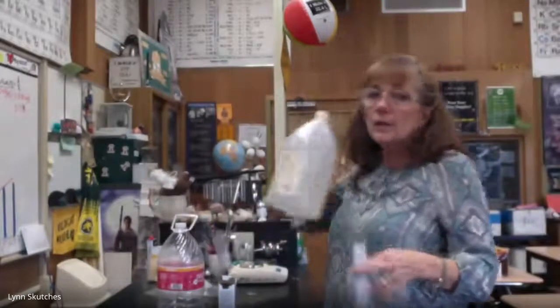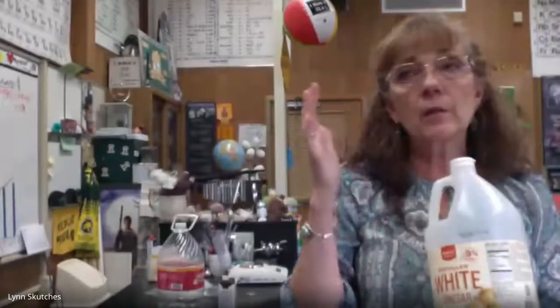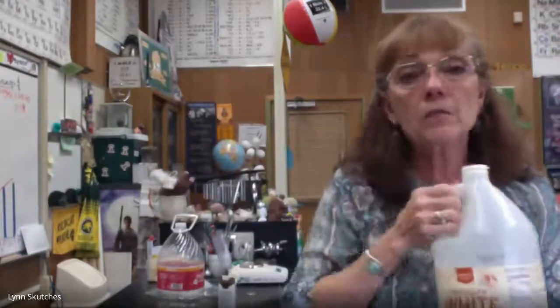Vinegar, it doesn't have to be white vinegar. It can be balsamic vinegar. It can be apple cider vinegar. It doesn't matter. This is vinegar. Okay, so you're going to put 50 milliliters of that in, and some salt.